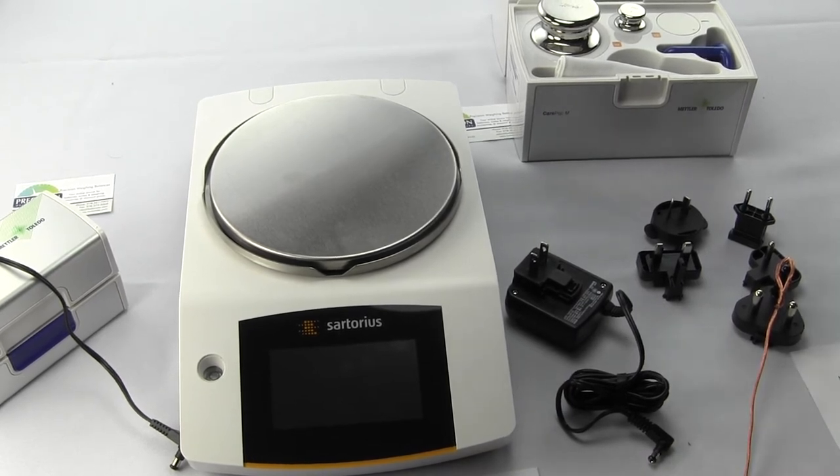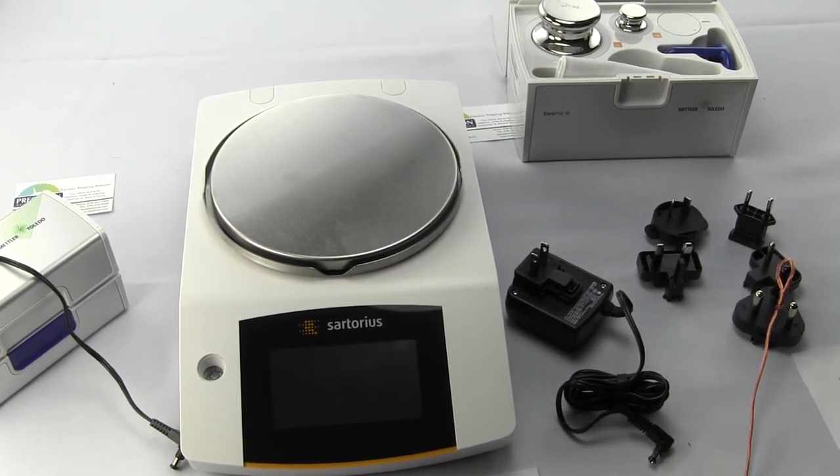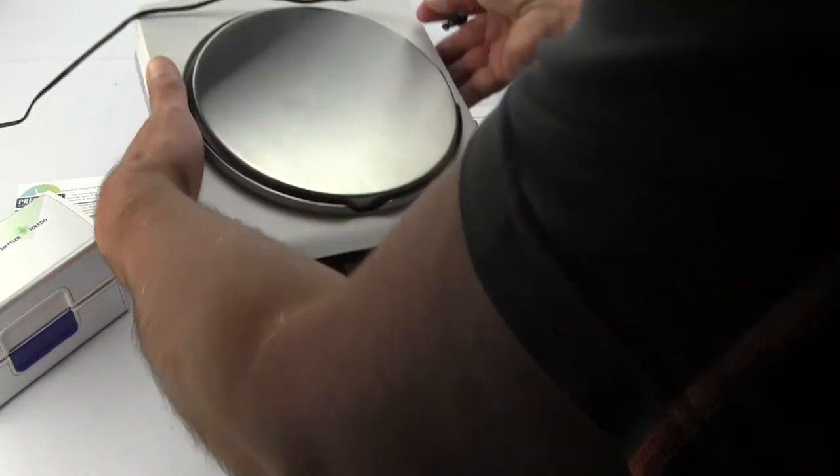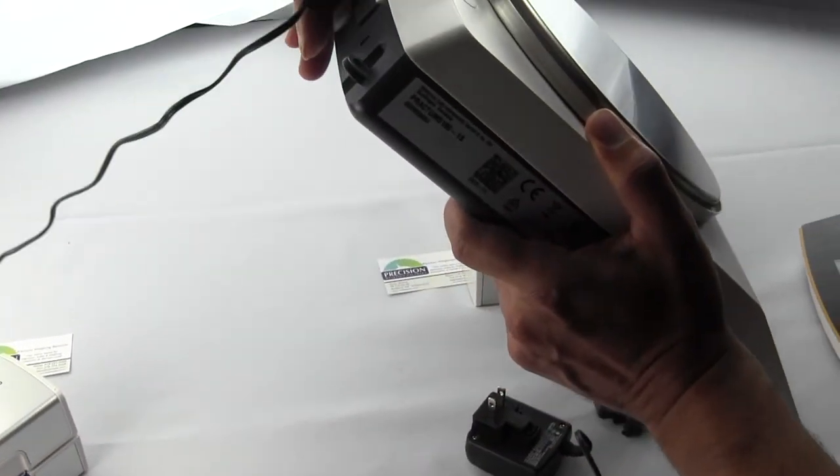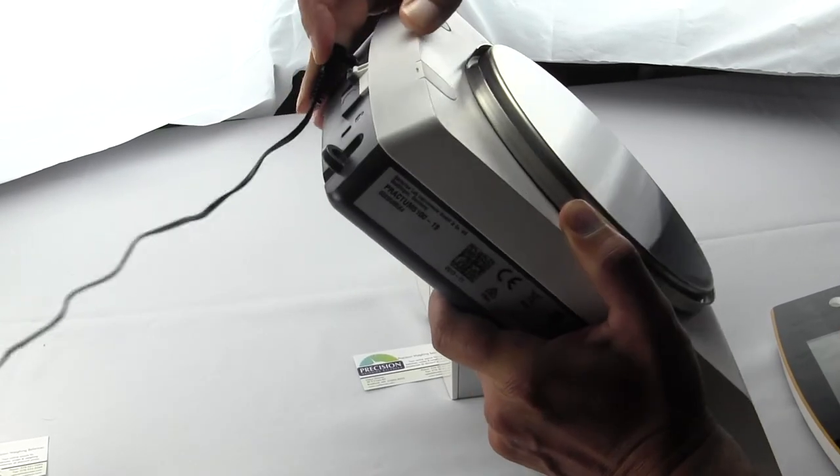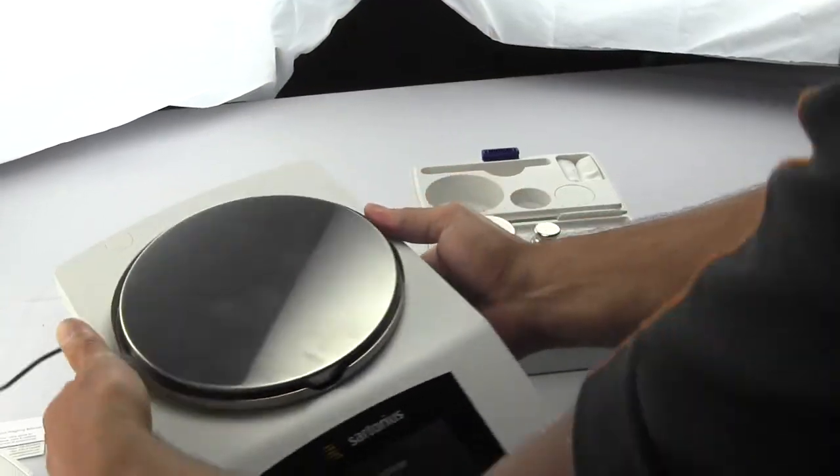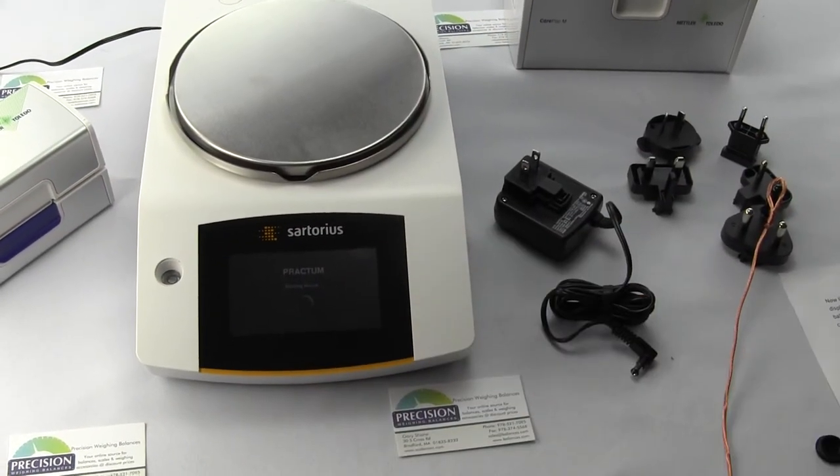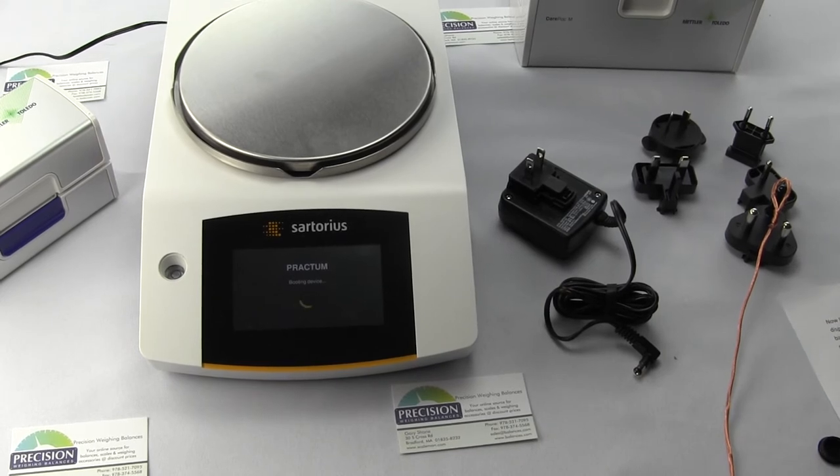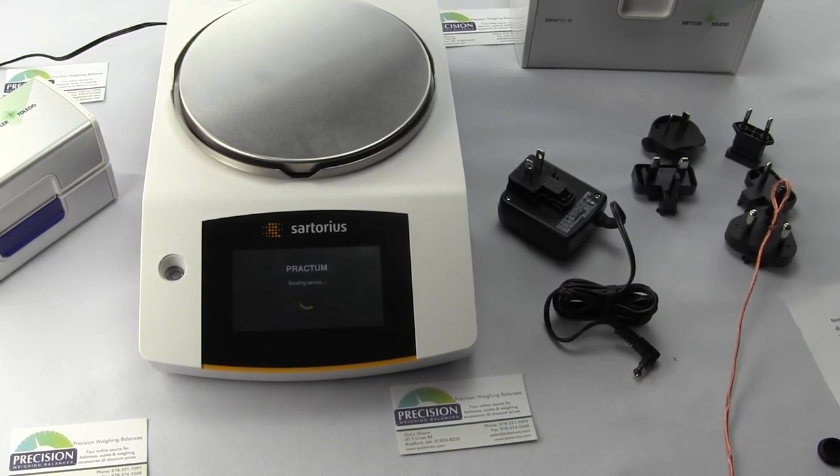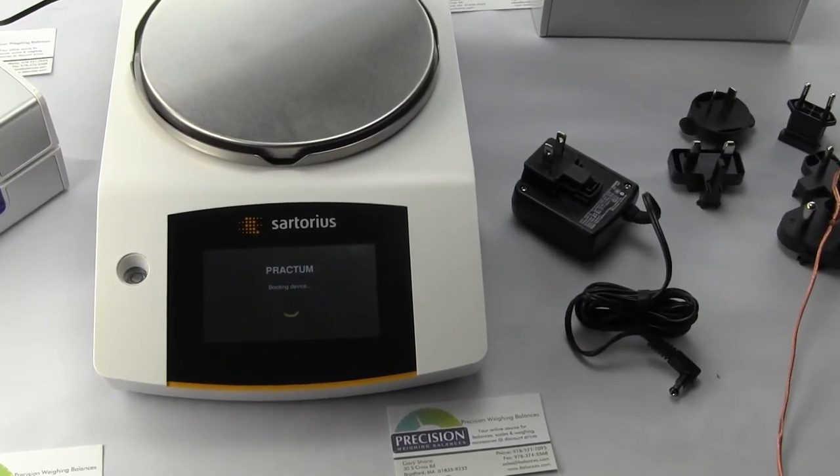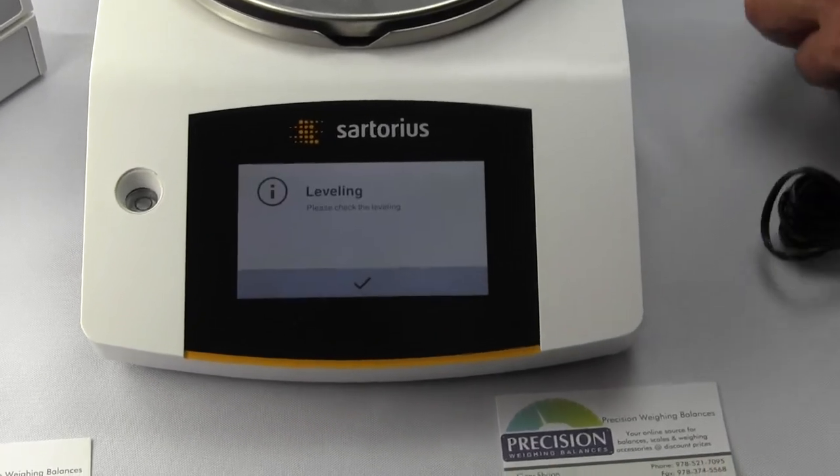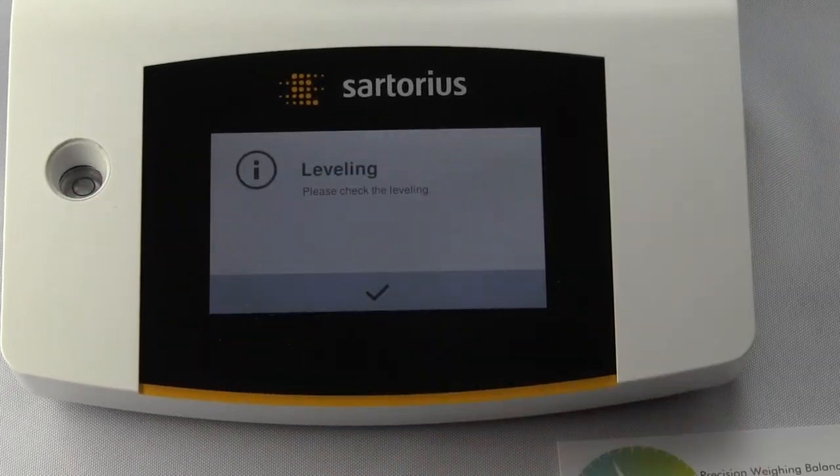Real quick, we'll power up this unit. I'll plug in my AC adapter. You'll see right away when you plug in the unit, it goes through the power up sequence with Sartorius saying it's booting the device.